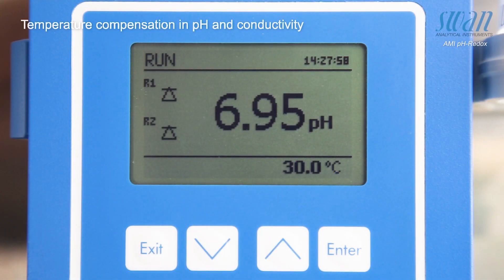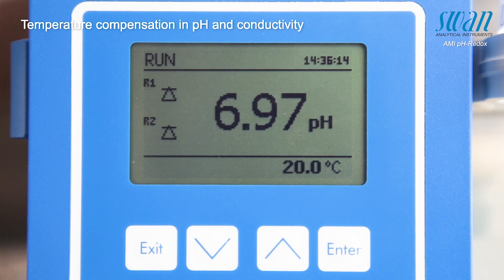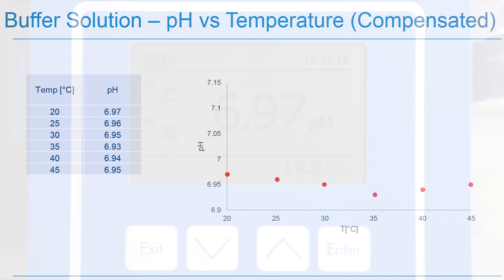Once the temperature compensation has been activated, the measured pH value becomes stable as the temperature constantly decreases from 45 to 20 degrees Celsius. This second chart shows the effects of the temperature compensation.